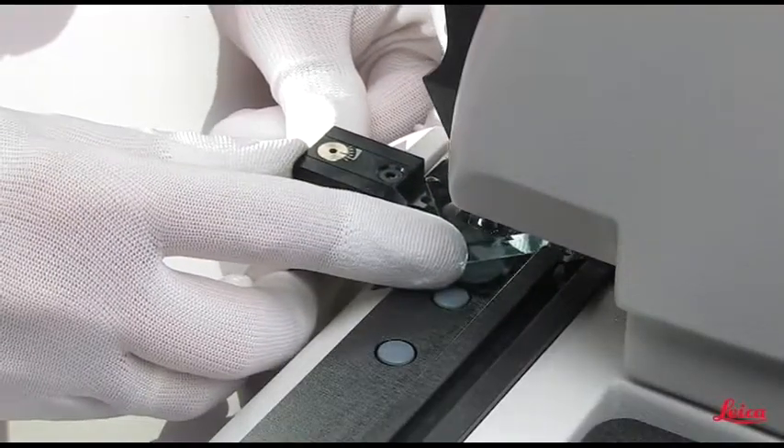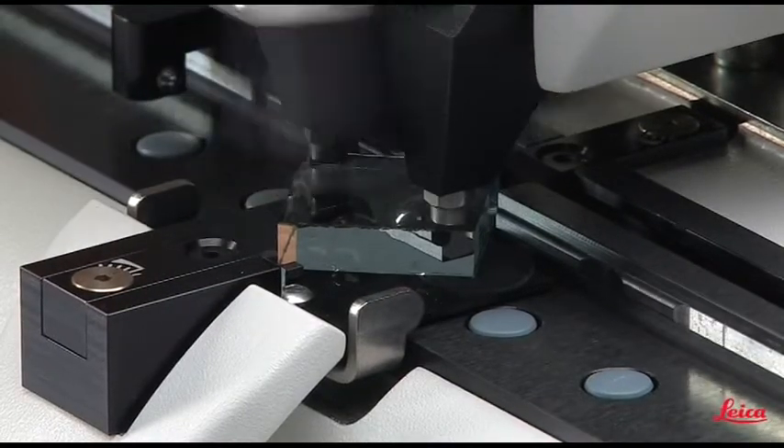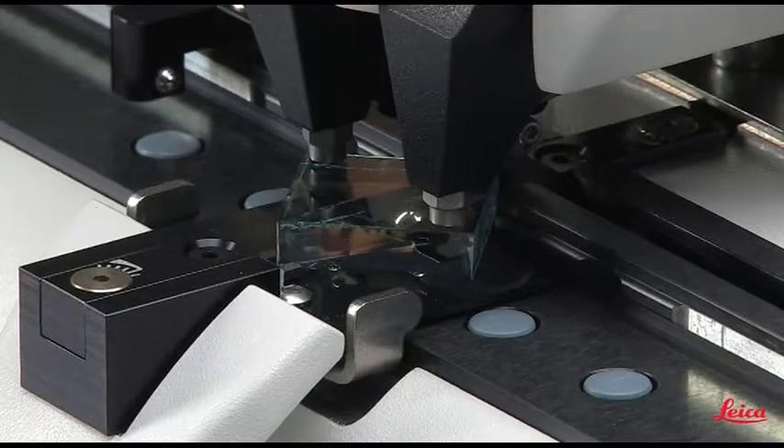The unique knife drawer allows easy positioning of the glass square and safe removal of the final knives without the need for any additional tool.